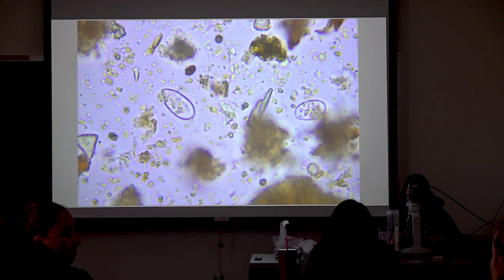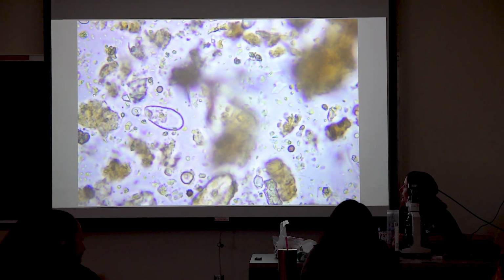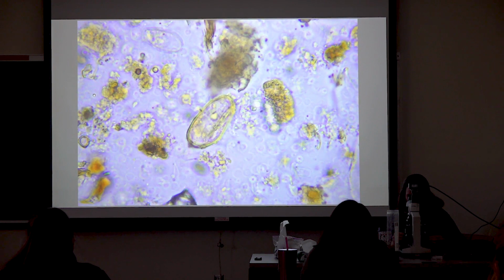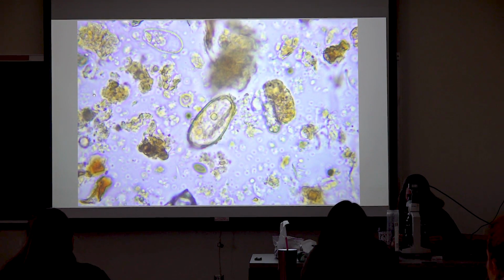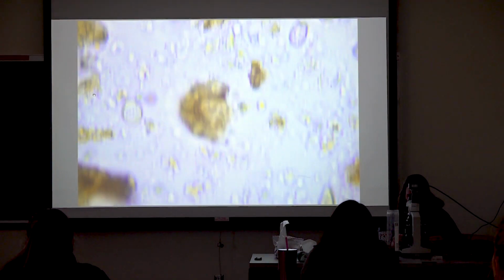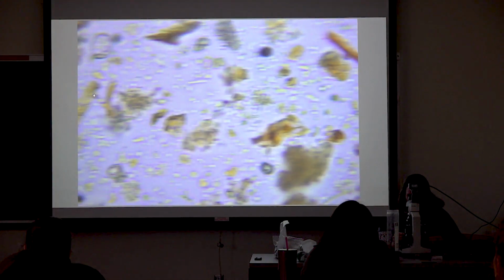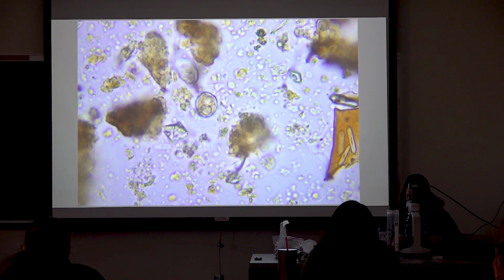All right, so we're going to keep looking around. And you'll notice a lot of similar shapes going on there. That might actually be something else, honestly. So you will find things like eggs from different microarthropods, nematodes. Different organisms lay eggs in your soil and compost. These look like some more types of testate amoebas. So you're also going to notice microorganisms in different states. A lot of them are going to encyst or go to sleep. So technically we don't count those.